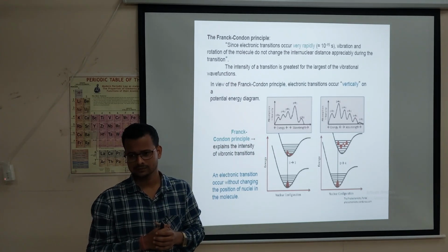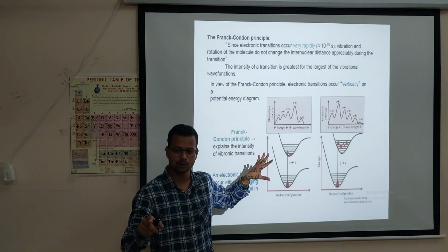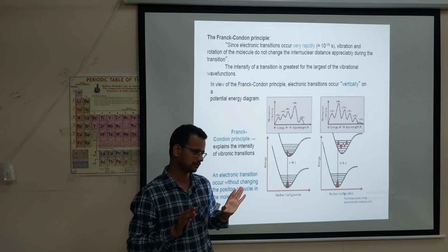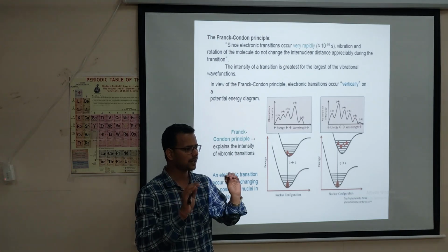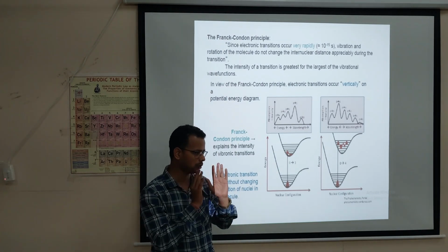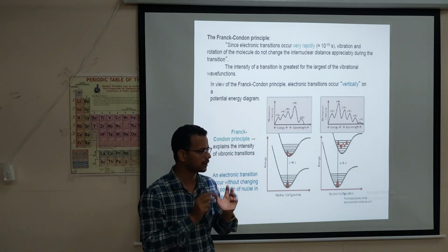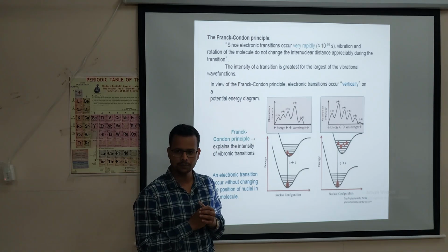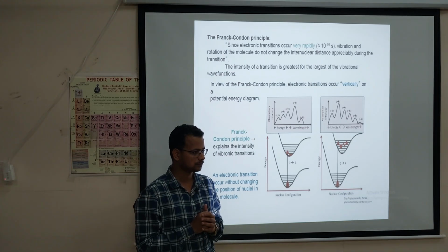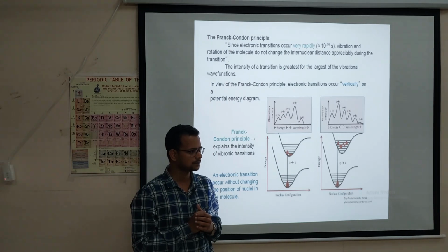In case of liquid sample, same. That's why I have already told you that in a liquid sample we calculate the concentration. In a liquid sample we do not have to measure the band gap. Based on the knowledge I have till date, no one will ask you the band gap of a liquid sample, like the band gap of water. It might be there, but I don't know. What I know I am telling you. If there is a solid sample, no one will ask the concentration of a solid sample. In that case, they will ask you the band gap of the solid sample. Get it?